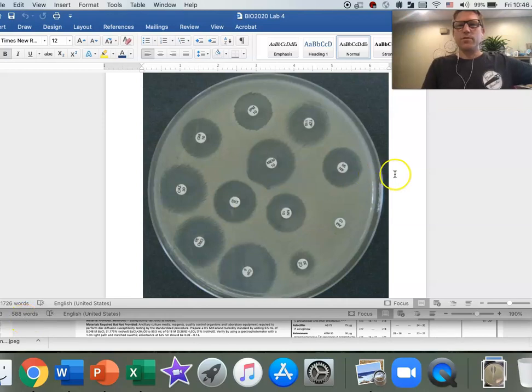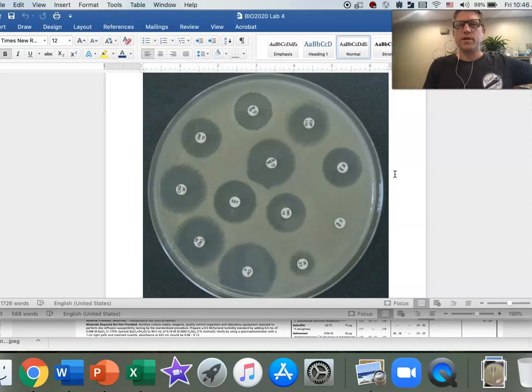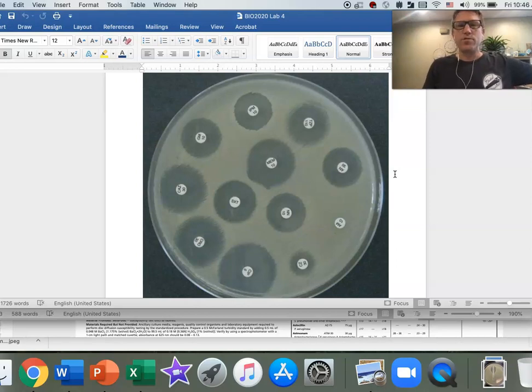Hey guys, I want to show you how to interpret your antibiotic disc diffusion results, in particular how to read the breakpoint chart.